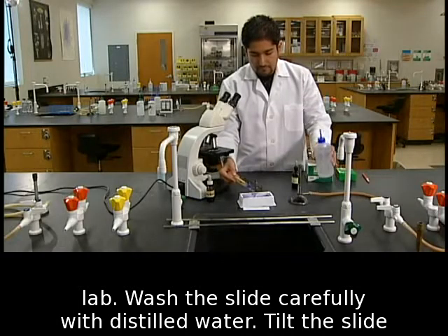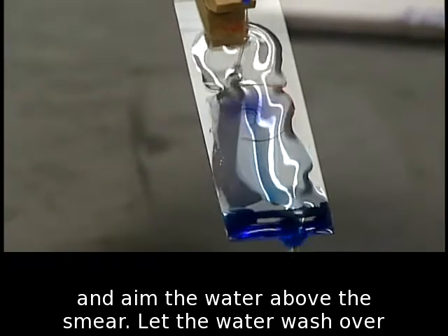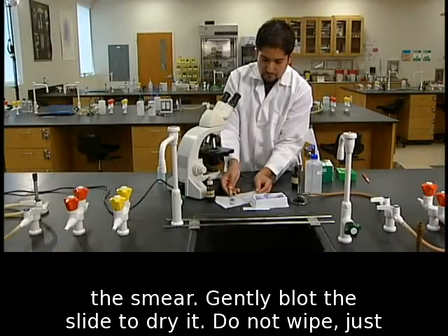Wash the slide carefully with distilled water. Tilt the slide and aim the water above the smear. Let the water wash over the smear. Gently blot the slide to dry it.